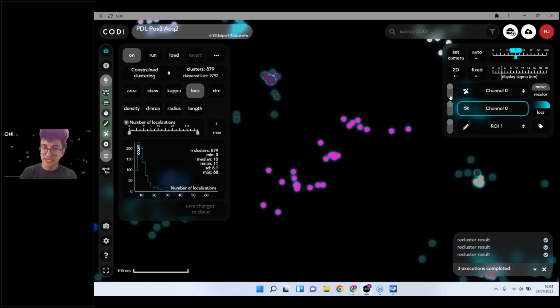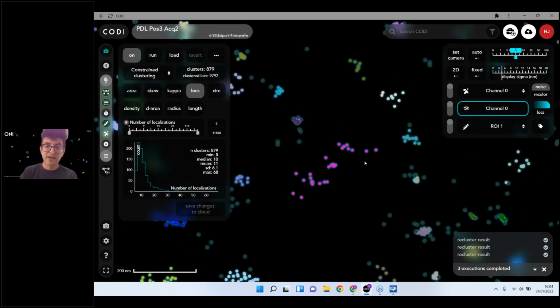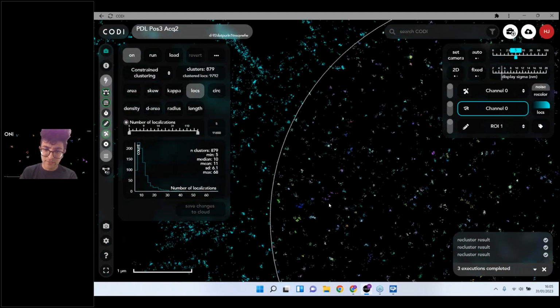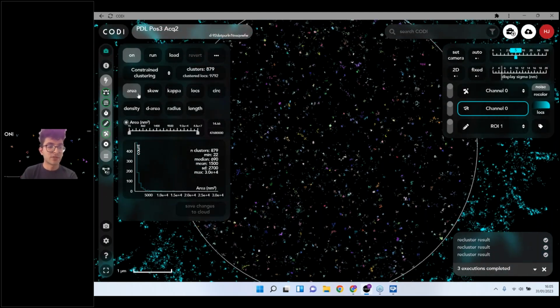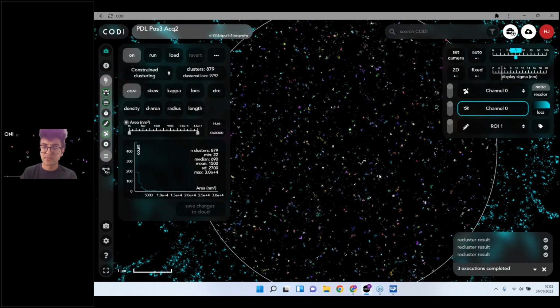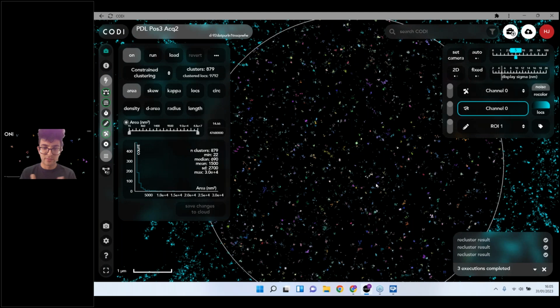And if we looked at the raw data to make sure, that possibly is the way that we would do this if we were just annotating. But HDBScan does have the flexibility, because of our constraint method on top of it, to make those adjustments. So we'll get to that in just a second. But you'll remember that, in the same way as dbScan, with HDBScan we can get the same properties. We can look at the distributions of area, of radius, and then we'll be able to export all of that data later for our analysis. So this is what the algorithm HDBScan comes up with by itself.